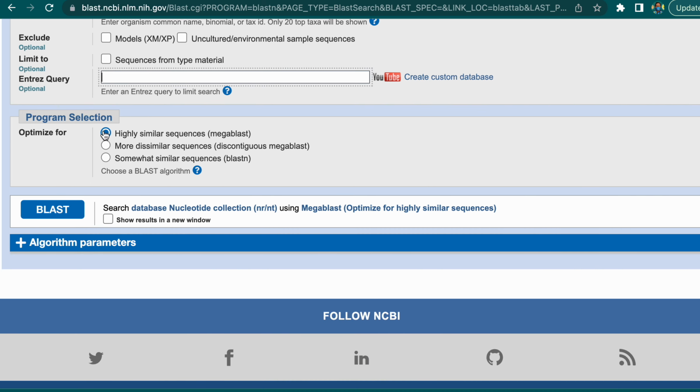The other things you want to do, so different types of blast, and basically we're changing the statistical threshold here. So megablast for highly similar sequences, really fast, very good. But if you start to get some mutations, if you have more evolution, megablast is going to miss it. So sometimes you're going to go down to BLASTN, and hey, if this is a Goldilocks story and that's too hot and this is too cold, then right in the middle is going to be where you want to go, which is the discontiguous megablast that'll find exact matches, but with some evolutionary shifting, like insertion and deletion.